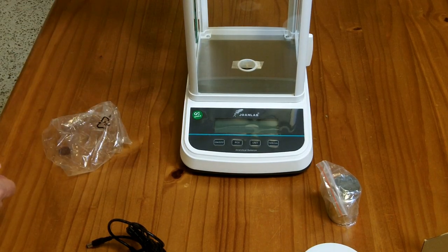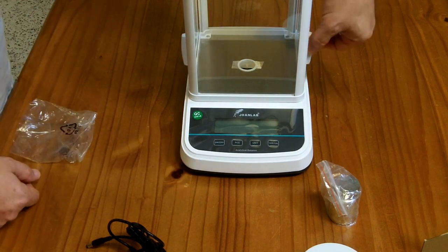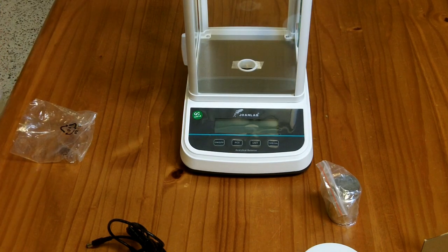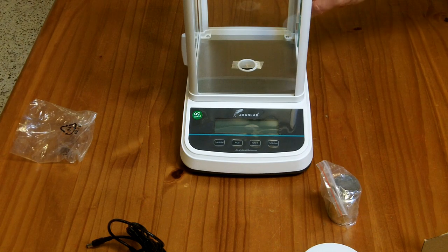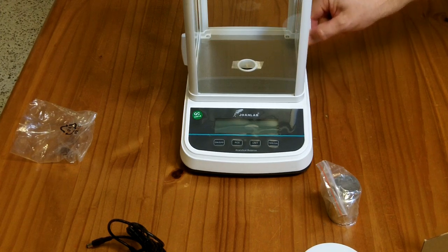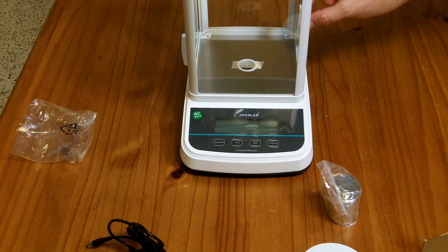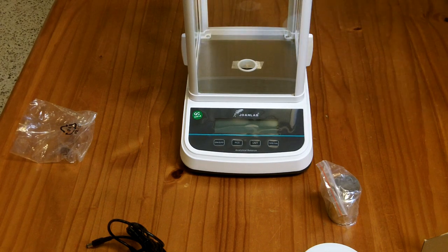So you can slide the top window back or you can access the weighing stage using either of these side windows. And the sliding motion is not super smooth. It's basically just within a couple of notches. And you have to keep the up and down parallel appropriately because if it tilts backwards under its weight it kind of jams. So you have to put a little bit of forward pressure on the top so it slides easily. The top one is a little easier to slide.